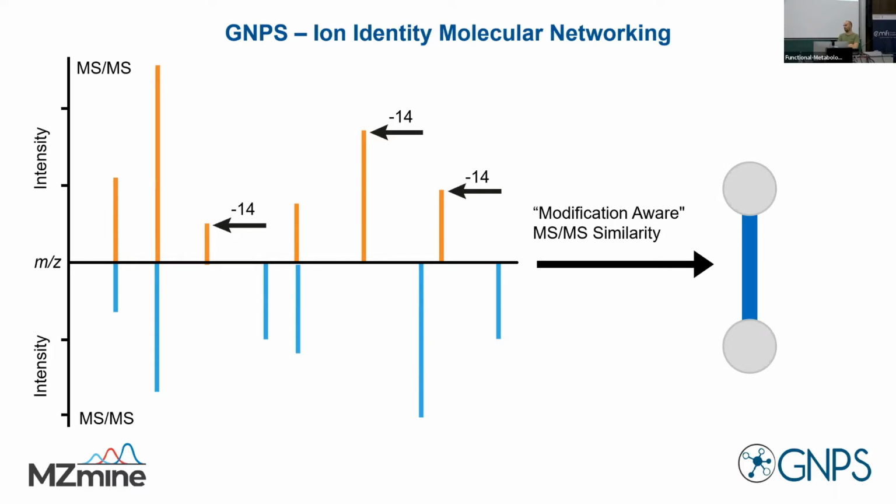Yeah, the networks from the default settings are kind of digestible. Most of the very prominent connections will be there, and you can go through the graph and make your connections of those annotations. But you could play around and just connect everything. You can make it more complex this way.